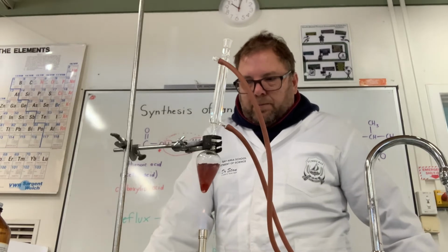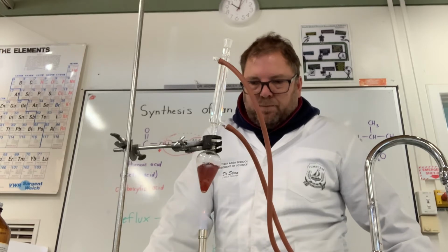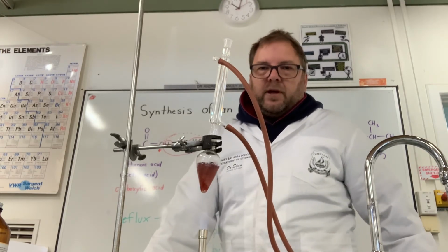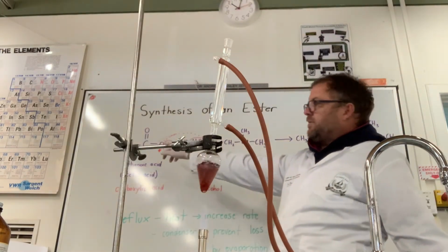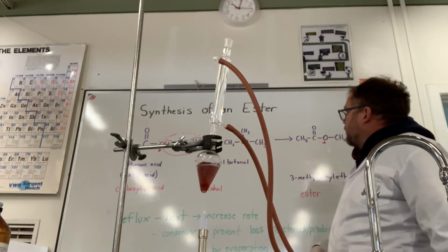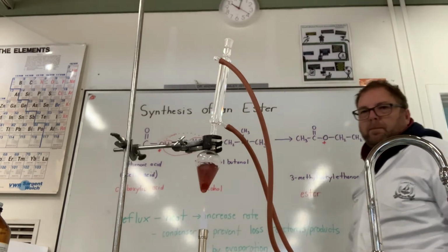I'm gonna pause. I might just then start recording and then just fast play it or something like that. But basically, this is reflux happening away. And hopefully this reaction, which you can't really see, is happening now between our acetic acid or ethanoic acid and 3-methylbutanol, to form our ester and water.